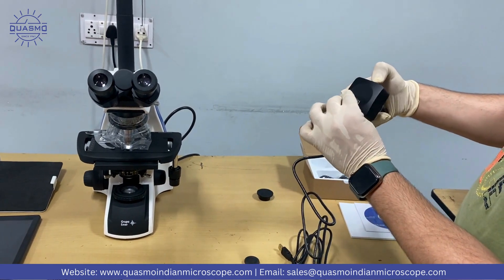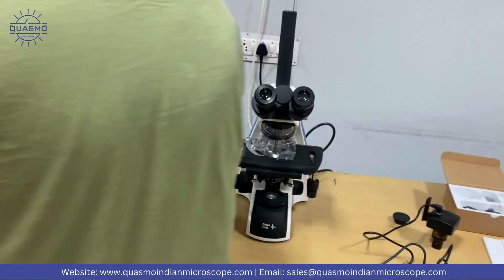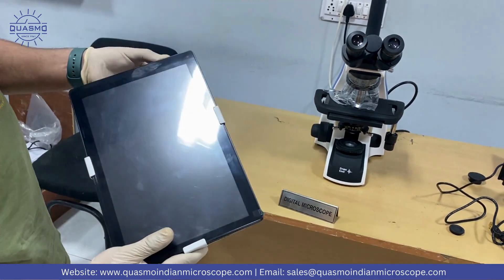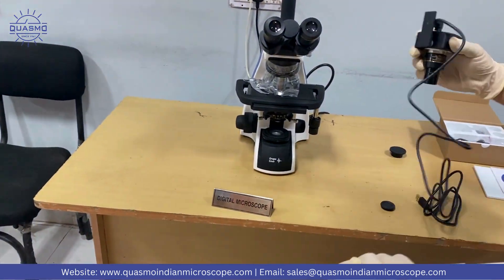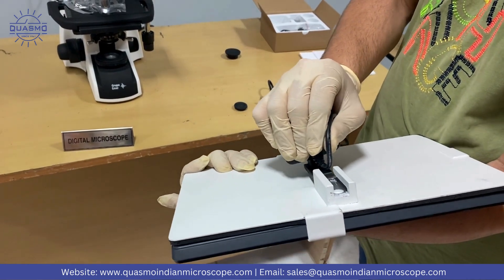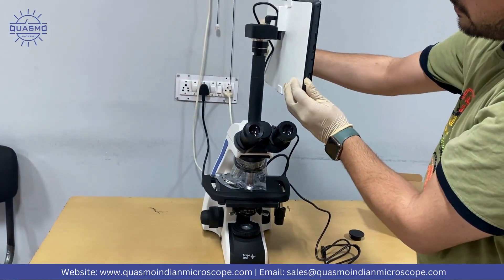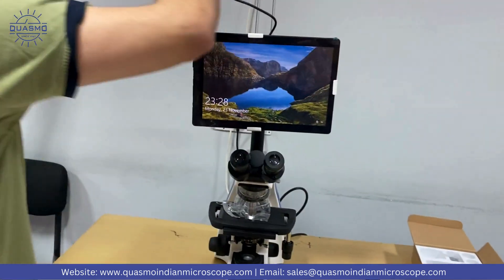The next step: take this — this is the stand for the tablet PC — and place the tablet PC right here. Next, we need to place the camera right about here, fix it here, and connect the cable with the tablet PC.